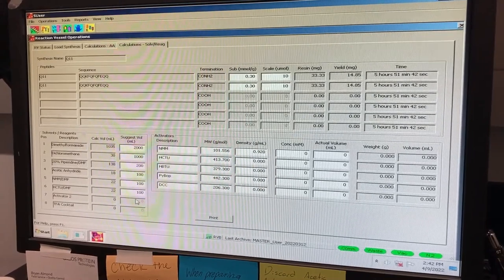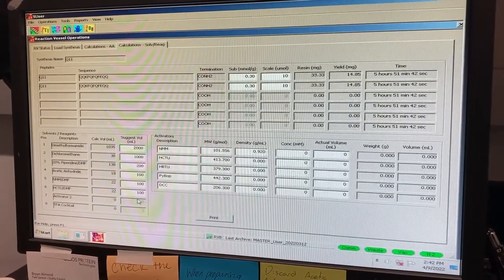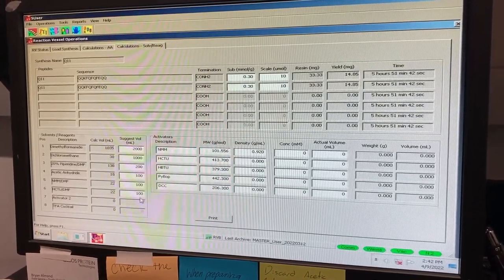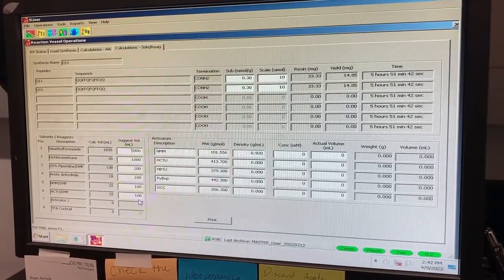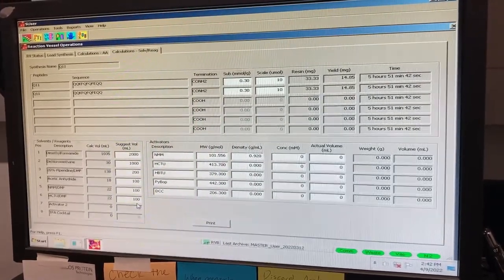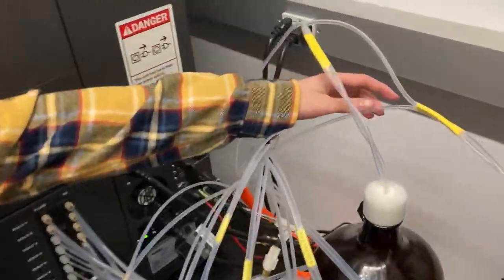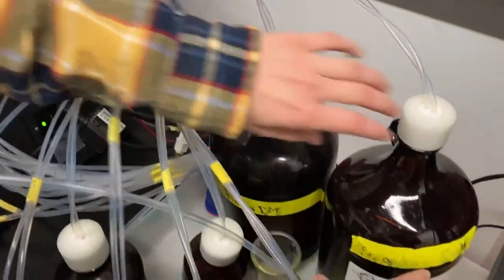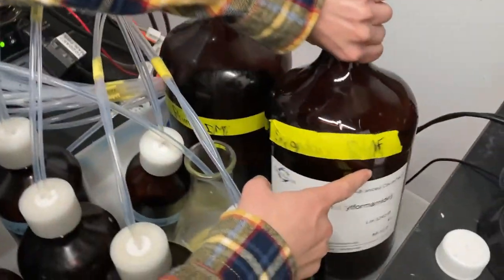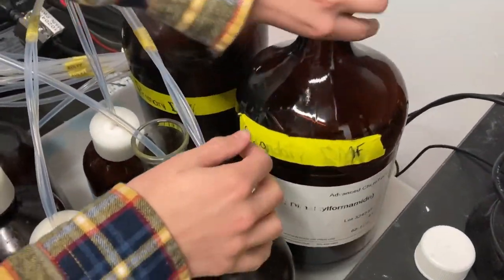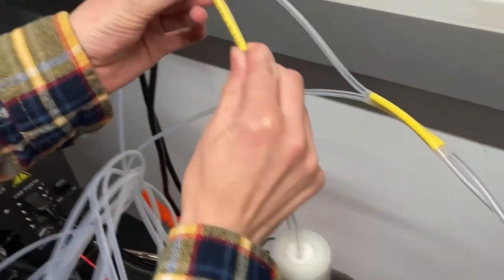These recommended amounts should be considered carefully, however. Most of our reagents keep for a long time, but some expire quickly. For example, the DMF solvent we keep in bulk because so much of this solvent is used during synthesis, and DMF keeps for a long time. Therefore, there is no harm in topping off this reagent.